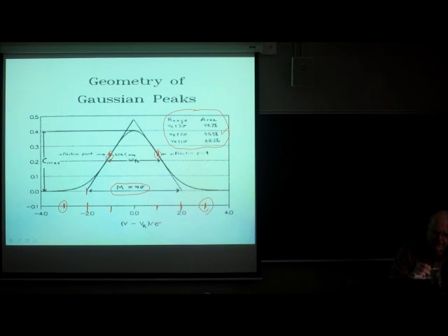And what you'll find is that the one on the left penetrates the baseline at exactly -2 sigma, and the one on the right penetrates the baseline at exactly +2 sigma. So if we're going from -2 sigma to +2 sigma, the width is obviously 4 sigma. This definition is very important because it plays into how we define resolution. So you need to know what M means.